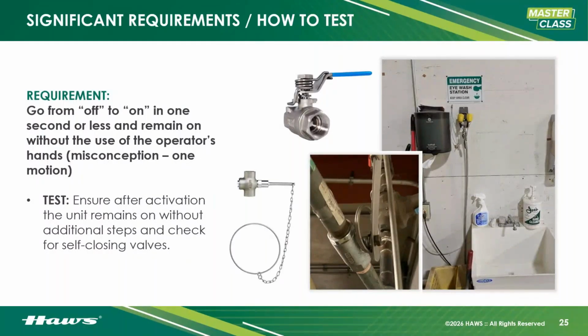The other thing you want to watch out for from a hands-free operation standpoint is the photo on the far right, the big photo. Not only is the eye wash facing the wall, which would require me to grab it and point it at my face to utilize it as an eye wash, it is really far off the ground. The valve type is not a stay open valve. You'll have to squeeze that the entire time, which is non-compliant. And to boot, there's an electrical outlet just to the left of it, which makes me a little uncomfortable.